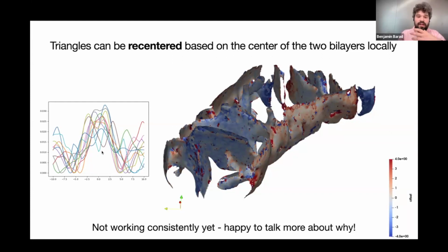And you have this iterative improvement where every time we do this, all of our measurements are less blurred out by local random variation. We get sharper and sharper measurements, in the same way that as you do refinement, you get better and better analysis of your protein structure. So, I think the tools for membrane-based averaging, surforama, and membranorama are going to work much better once we've taken our meshes, which were pretty good, and made them much better.